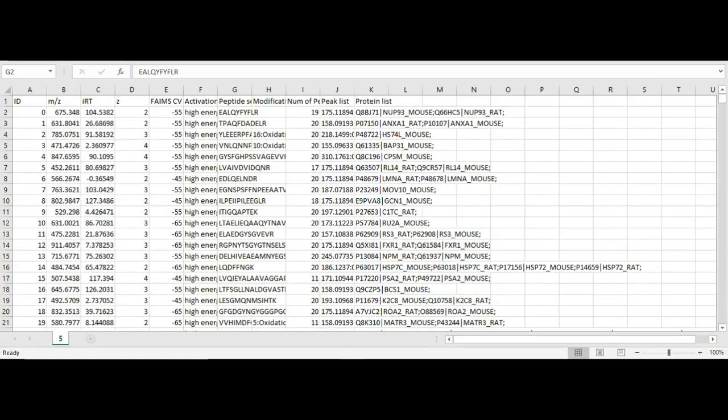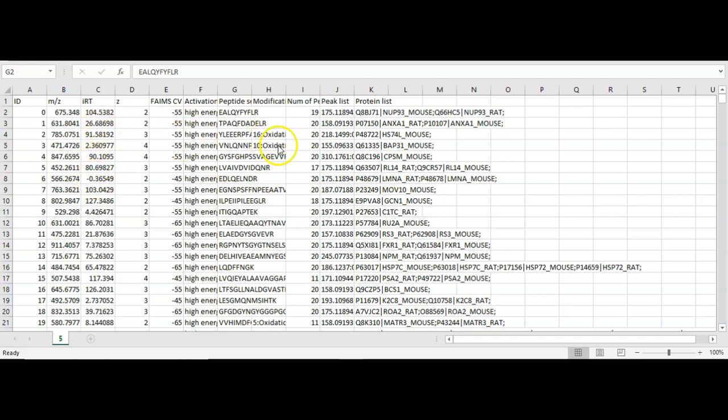One of the great things about the new PEAKS library is that it's available in text format. Here you can see in Excel what the library looks like. Here you have the M over Z, the normalized retention time for the peptides, the peptide sequences, and the PEAK lists.